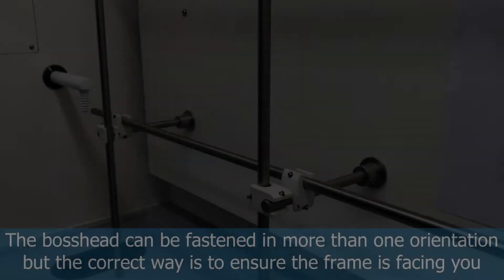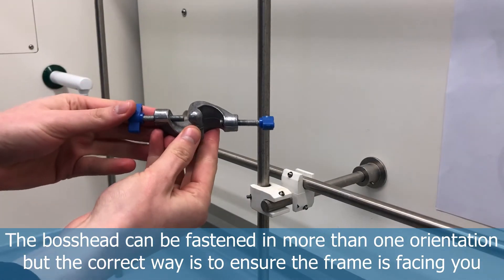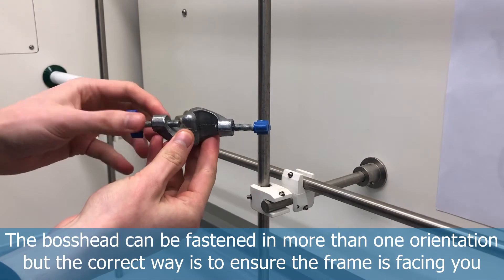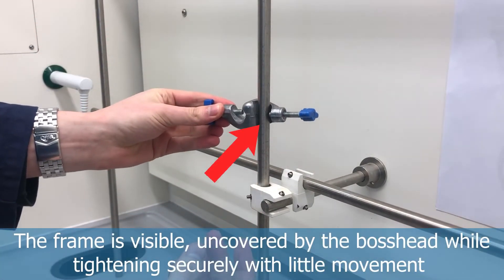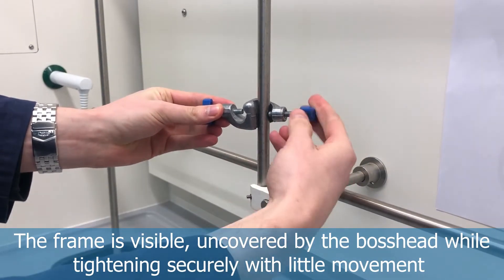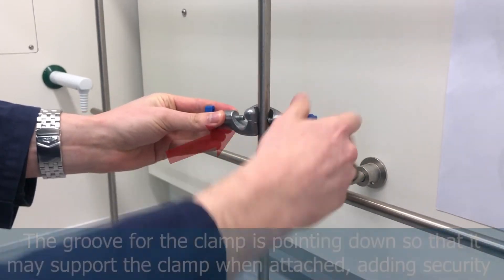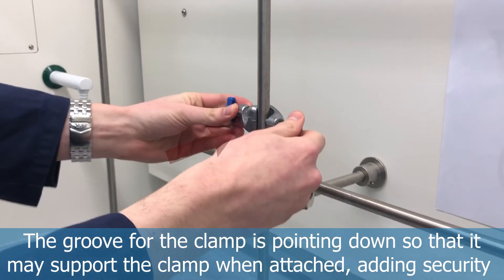Select a vertical bar on the framing, then get the boss head and tighten it to the frame. You want to select the orientation where it's facing you, so when you tighten the boss head you can actually see it tightening against the metal bar rather than being covered by the groove. This makes it more secure and lets you see if it's loose or if there's any issue.